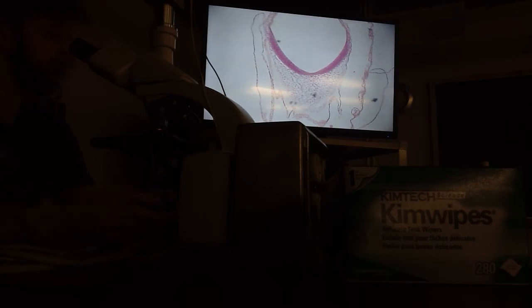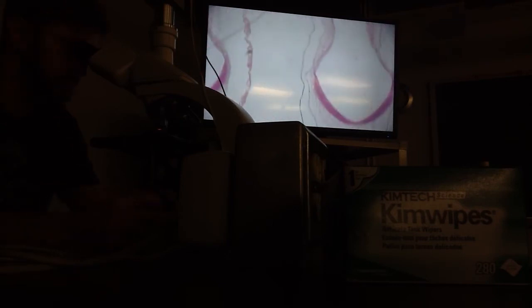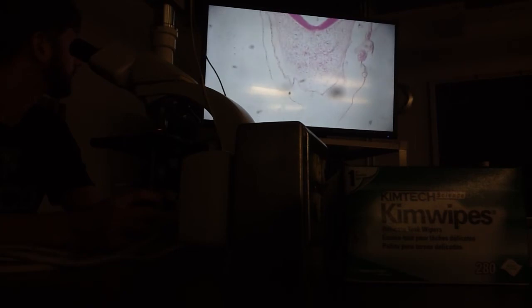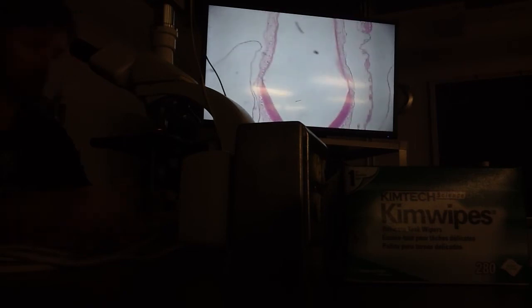Let's find better ones. Let's cut into the developing embryo. You're missing half the embryo. I am. It's hard to distinguish. All right, stop. Go up and down the embryonic body. And here, we're looking through the embryonic body, and the knife blade is obviously striking part of the brain. Okay? Continue.